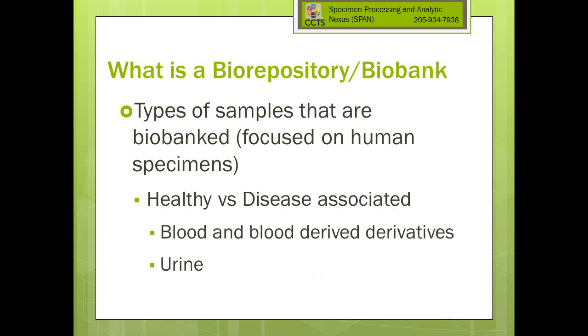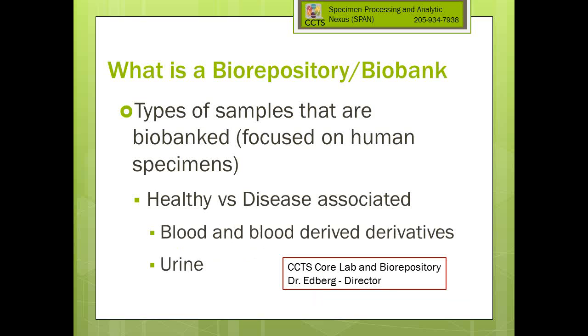Certainly, if we're working with blood or blood derivatives or urine, I would suggest that our lab in the CCTS, which I'm the director of, and I'll give some contact information at the end, would be a place to get information about how to do this. It doesn't mean that we have to do it for you, but certainly you're welcome to use this as a source of information and guidance on how to think about collecting and storing these types of specimens.